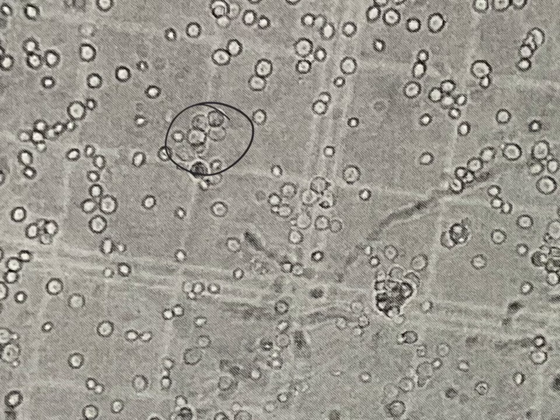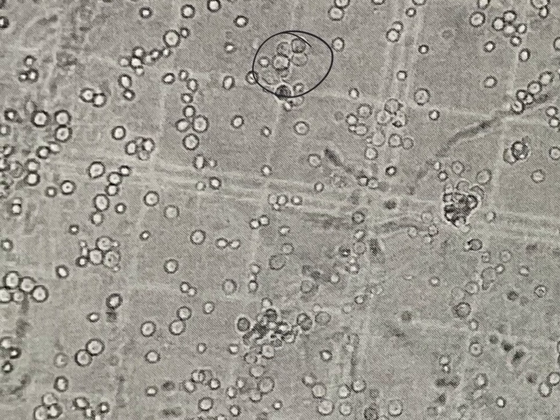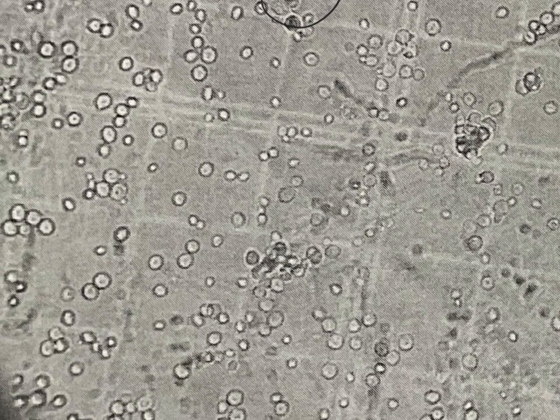In a practical exam, they might ask what the difficulties are or how you prevent clumping. Just make sure that you stir your solution well, because it's very hard to count the number of cells accurately. So don't pick a square that has got a clump in it.